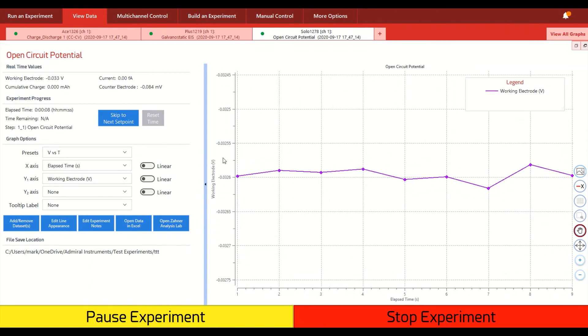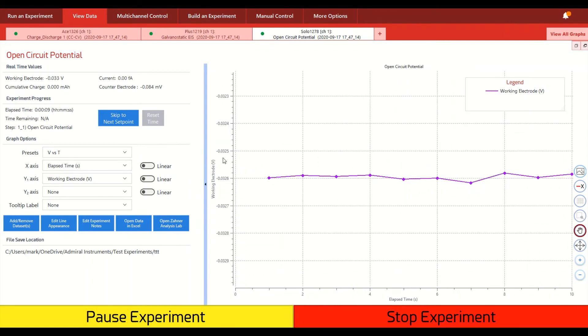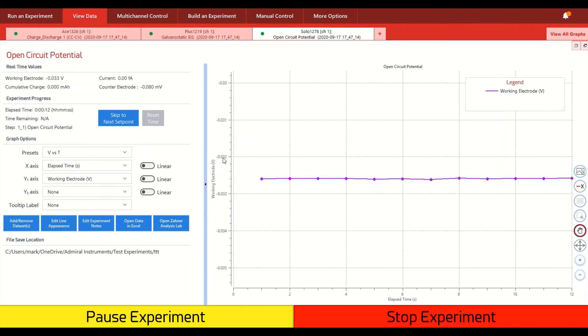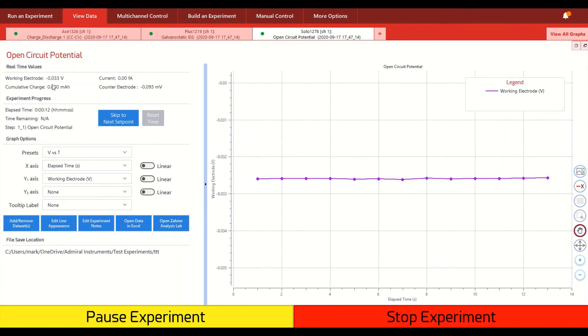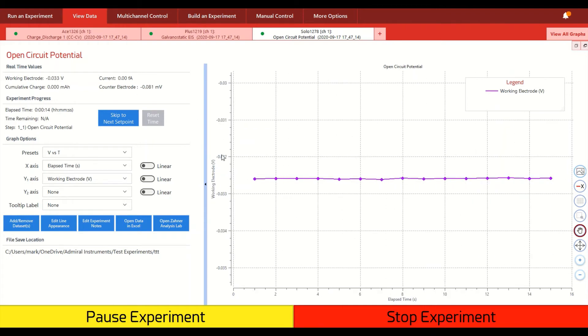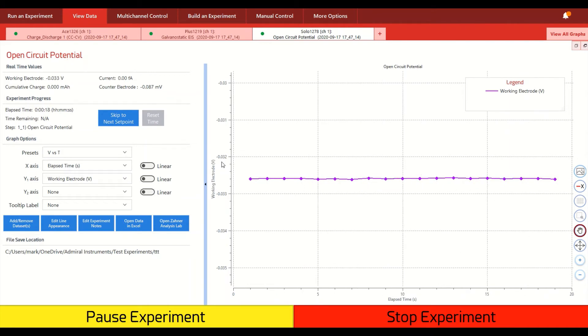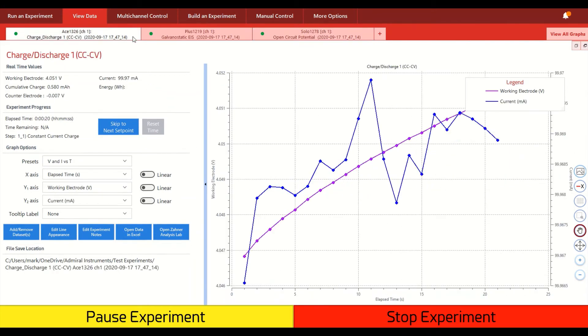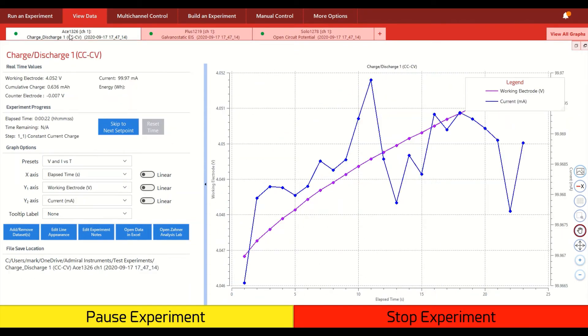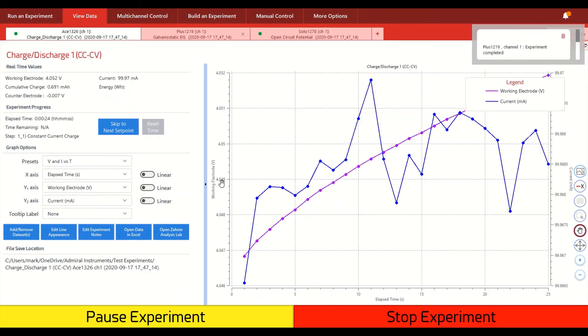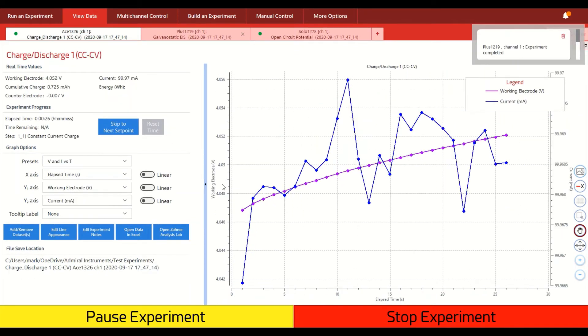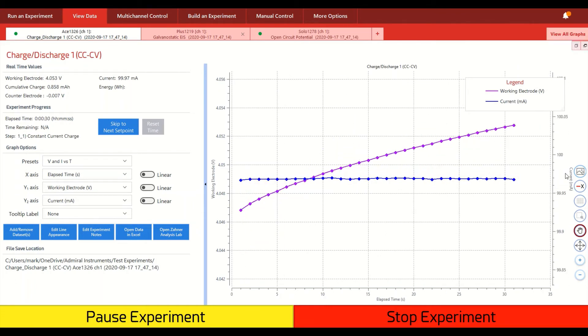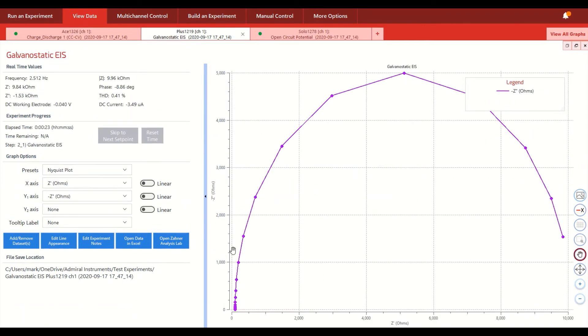So this is what our view data tab looks like. So you can see all the real-time values as they're being collected. In this case, this is just open circuit potential that's being measured. But we can see if we click to the different channels that we have here, like with our Squidstat ACE unit that's running charge discharge experiments on the 18650 cell that is currently connected to it, or the Galvanostatic EIS that's being run on a Randall's circuit.